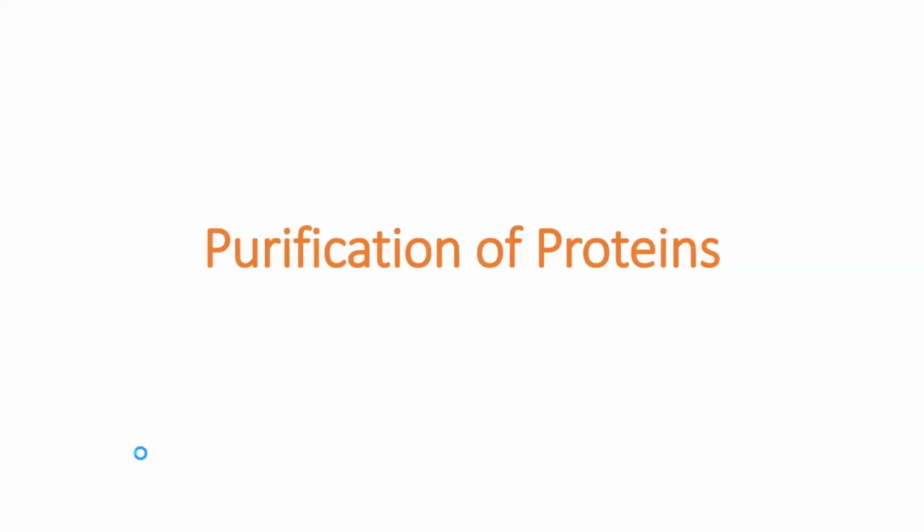So, as we started yesterday, we are going to look at protein purification, or the purification of proteins. You know that generally proteins are found in a cell, and for you to get those proteins out of a cell, you have to apply a lot of techniques. There is a series of isolating techniques that we have to apply when trying to isolate proteins from a cell.